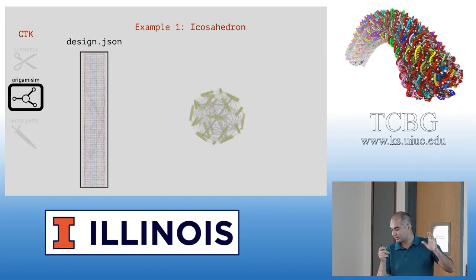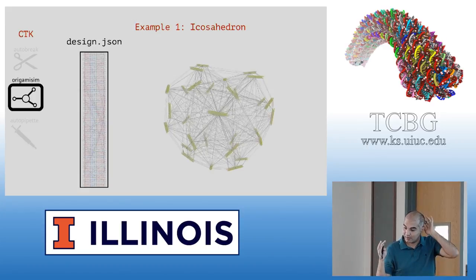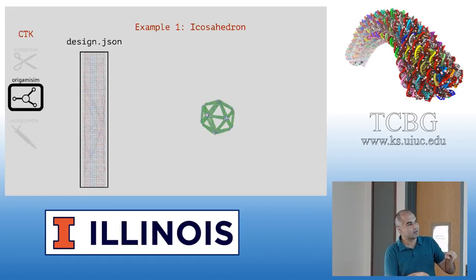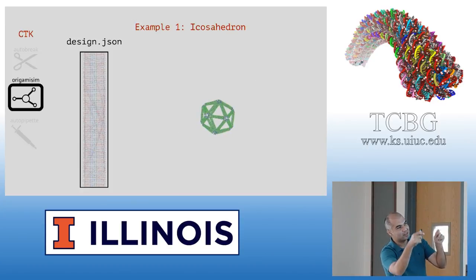What I do is expand. When I do this expansion, I'm actually projecting everything on a sphere in the initial part. The way I estimate the sphere radius and the distance between each part is just based on the geometries. I get the lengths of each rigid body, get the maximum, and then I overestimate what the sphere will be, project onto it, and then let it equilibrate. Then I put the bonds in register, and then put the final sphere.